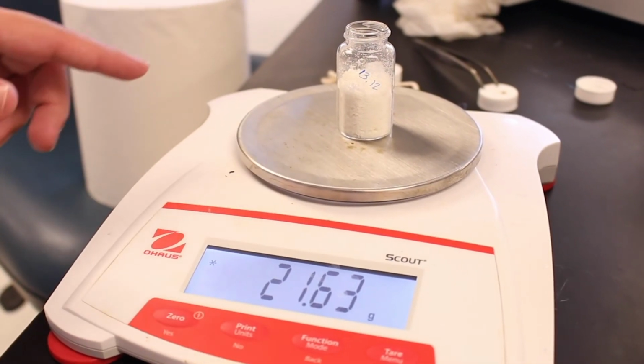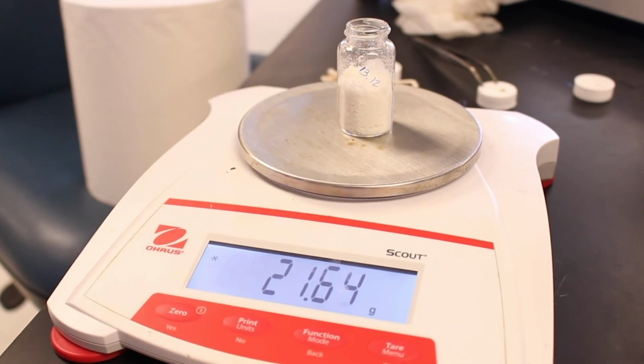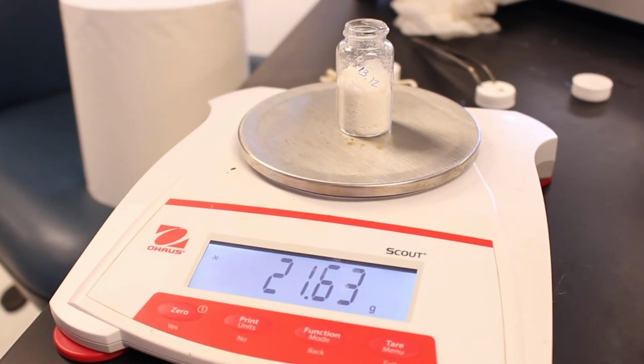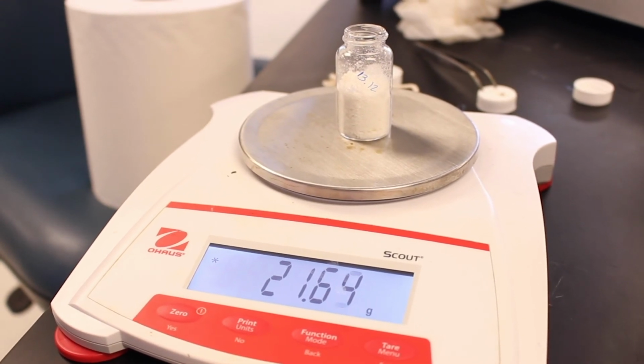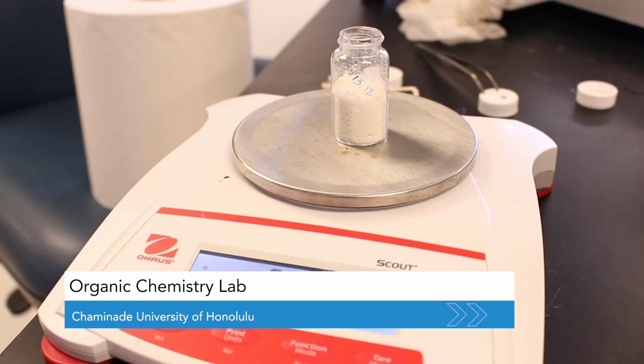Okay, so our product is dry. It's been in the vacuum desiccator for a few hours. We placed it on the balance, and the amount of product we have is 8.51 grams. Okay, so you can use that value, 8.51 grams, to calculate the percent yield for this reaction.